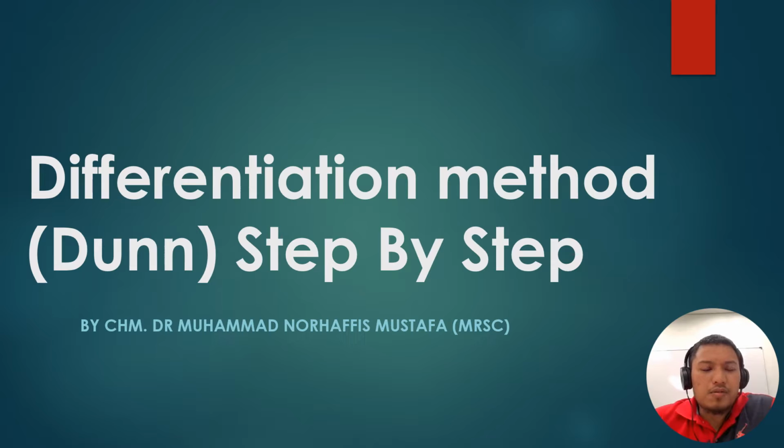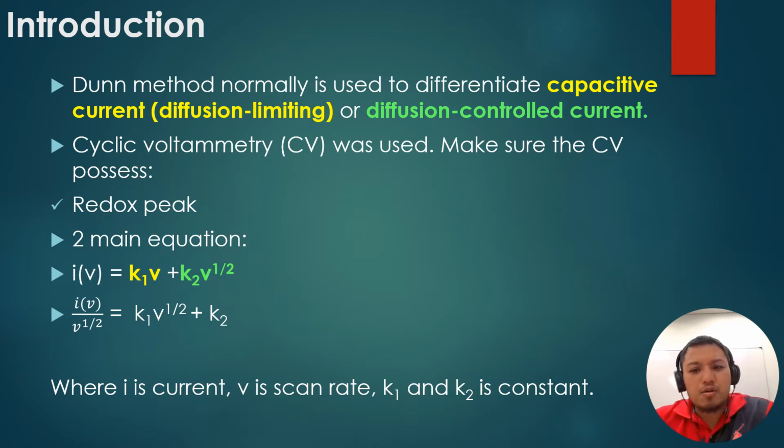So today I'm going to teach you the differentiation method, which is the Dunn method, step by step. I have published quite a lot of videos regarding this matter, but I received a lot of questions. Some of them might not be clear, so today I'm going to clarify and explain again step by step what the Dunn method is and how exactly to establish a good stepwise process so you can also provide the analysis to support your finding. Okay, we start with the introduction.